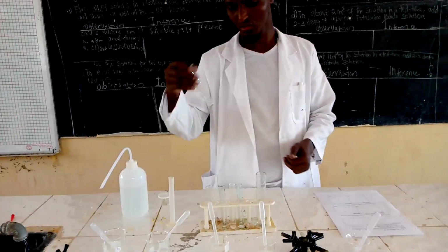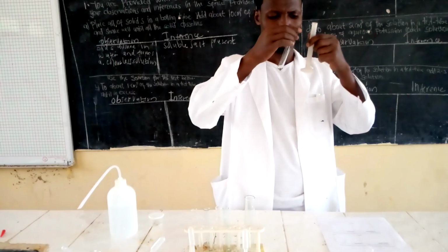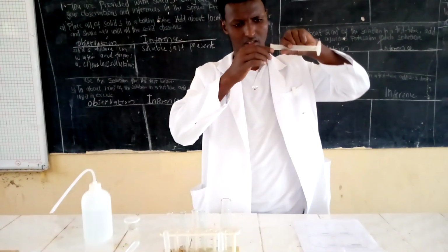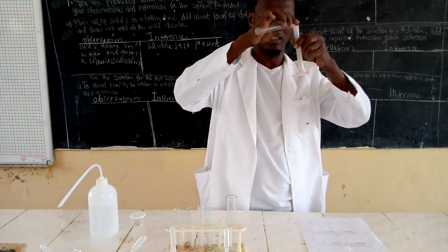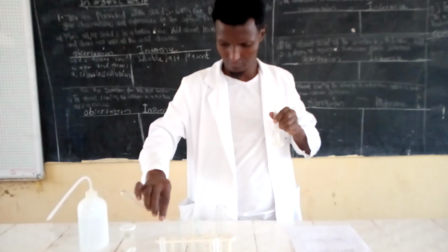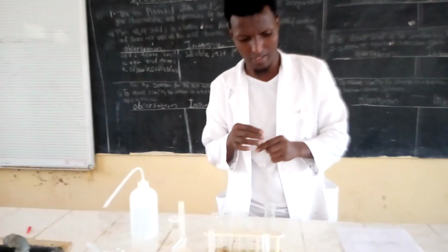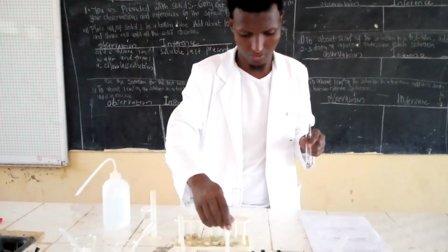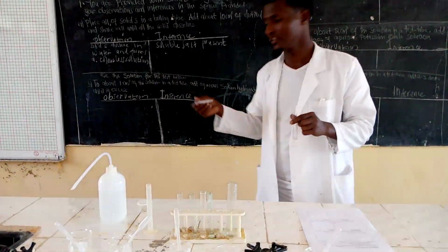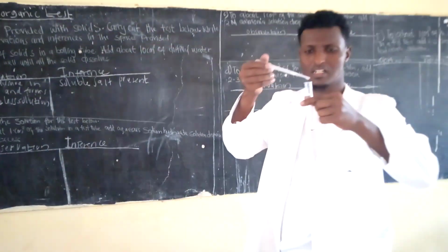So I will add sodium hydroxide. This is my sodium hydroxide. They say add sodium hydroxide dropwise, so let me add it dropwise.